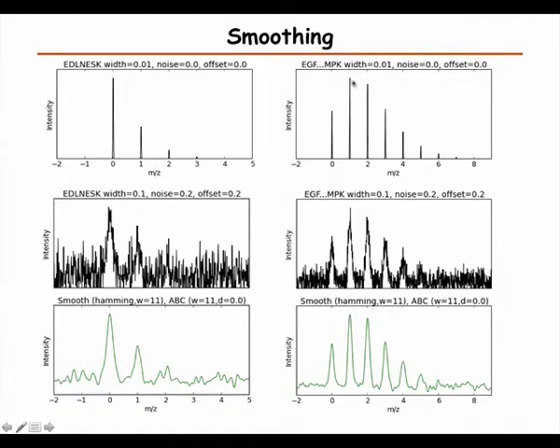But we can definitely lift out and see the peaks better. And this is another example of a larger peptide that has more isotopes. We see it with wider peaks and noise. And in this case, we can recreate the first few peaks quite well.